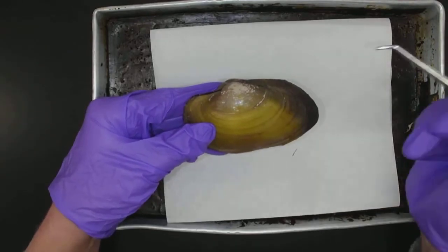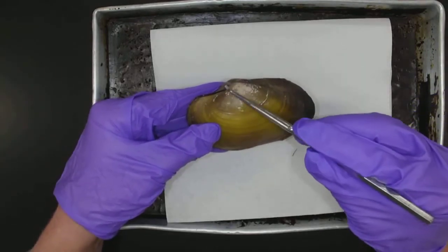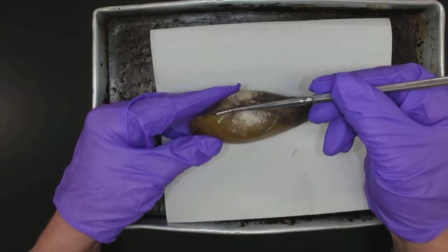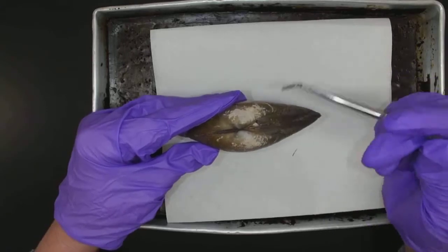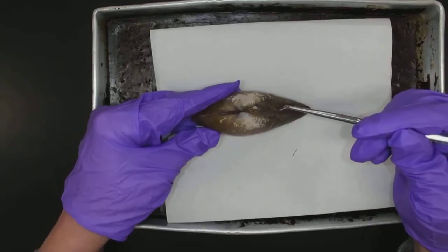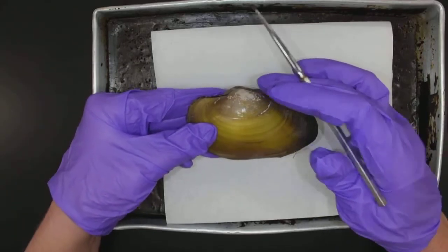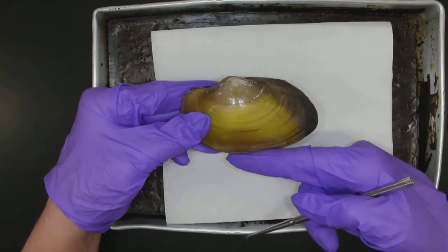So the umbo — like elbow in my mind — is this bump. That's the umbo, and it's close to this hinge right along here. So that's dorsal — that's the dorsal hinge. Umbo and dorsal hinge, and then this is the ventral side.